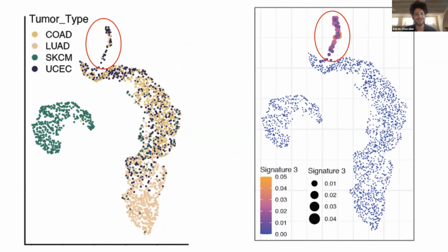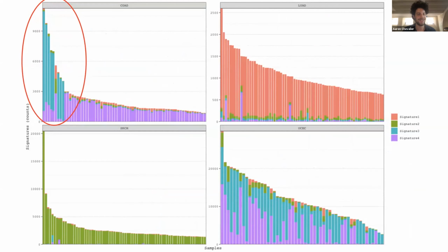Next slide. Okay, so there's a lot of analyses that we can do. We support UMAP as well, but if you could just go to the last slide. So we can see that there's just these few mutations that have very high mutational counts.